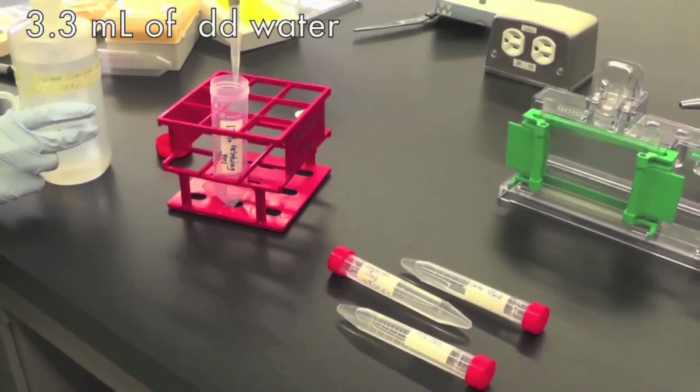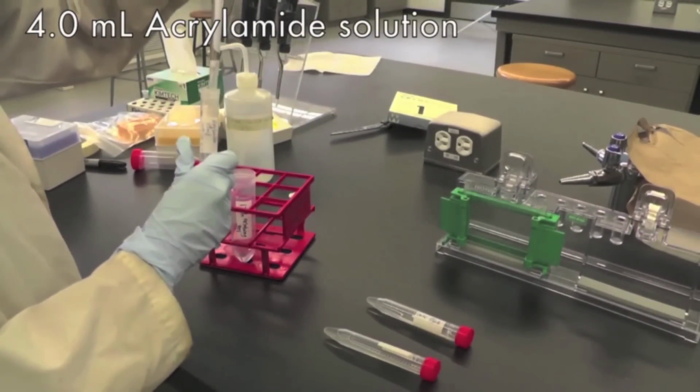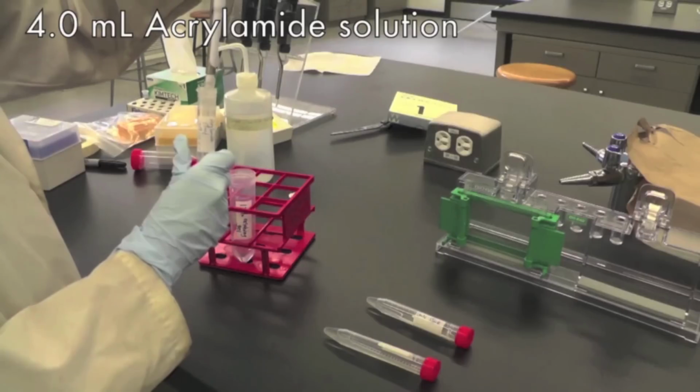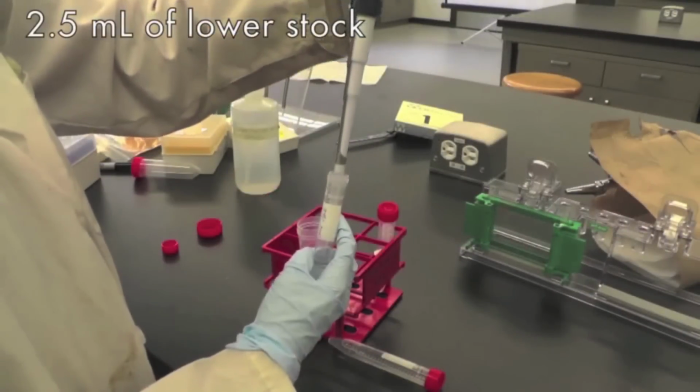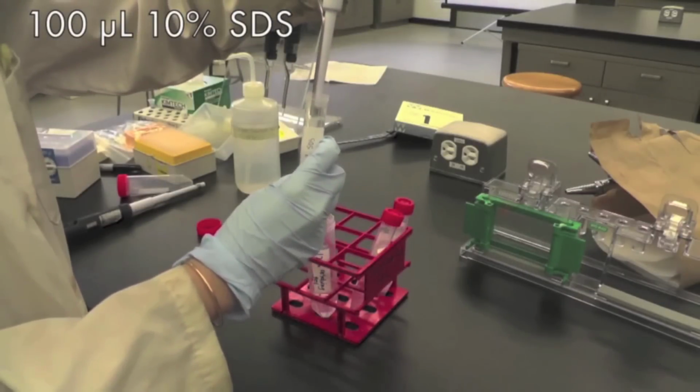Mix 3.3mL of DD water, 4.0mL of 30% acrylamide solution. Liquid acrylamide is neurotoxic and should be handled with caution. 2.5mL of lower stock and 100μL of 10% SDS together.